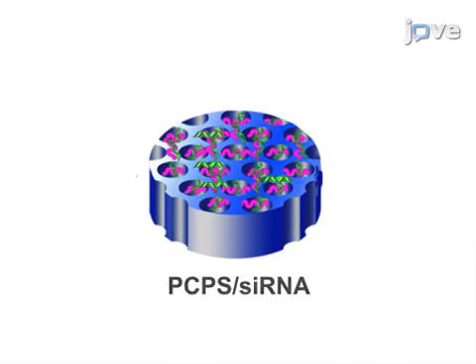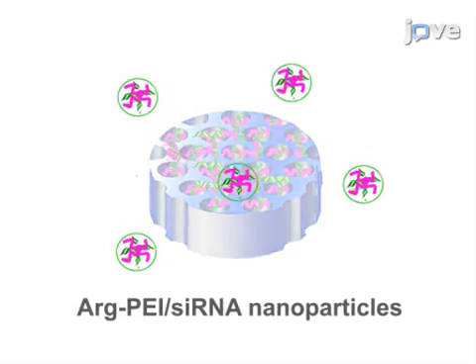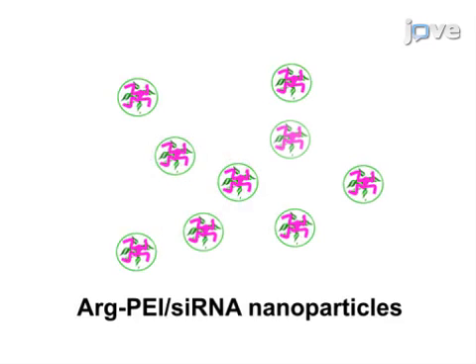Next, arginine polyethylenimine siRNA nanoparticles will be formed as the silicon gradually degrades in order to enable sustained release of the siRNA.